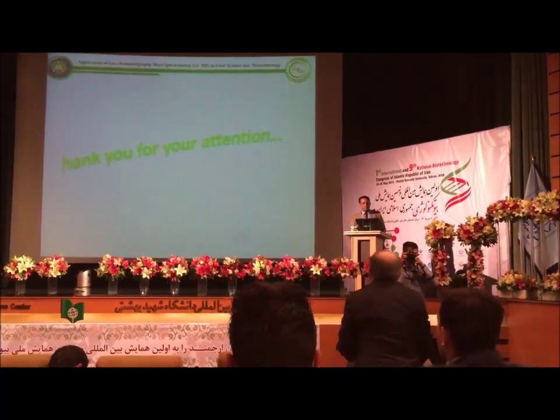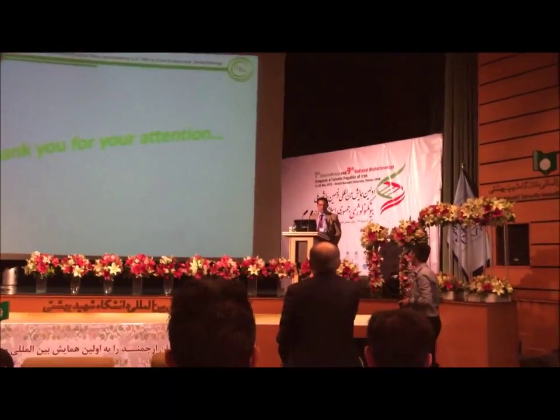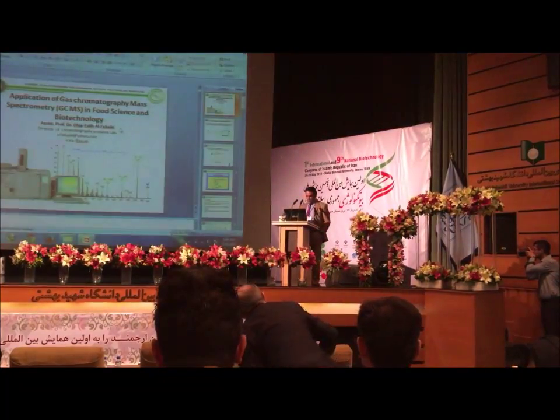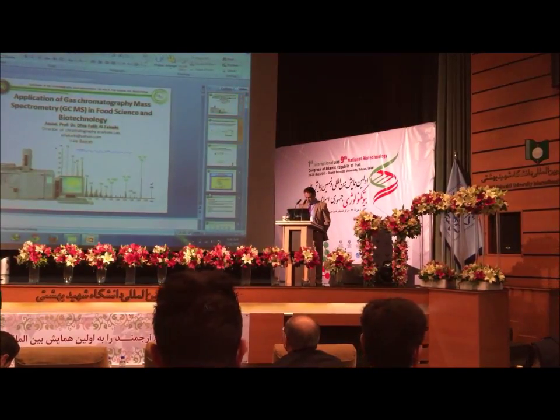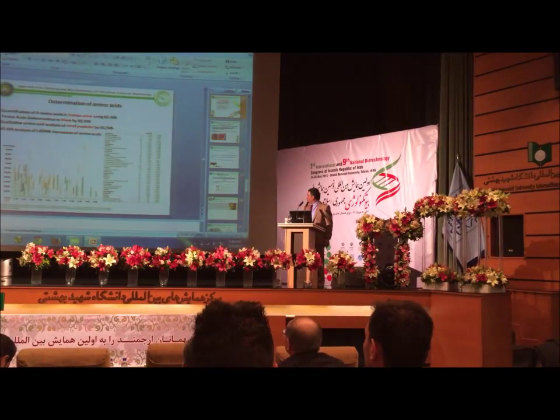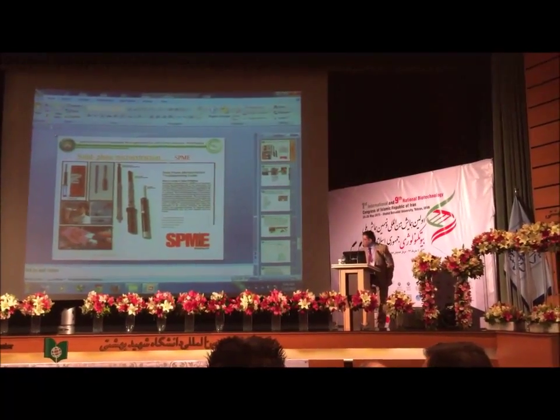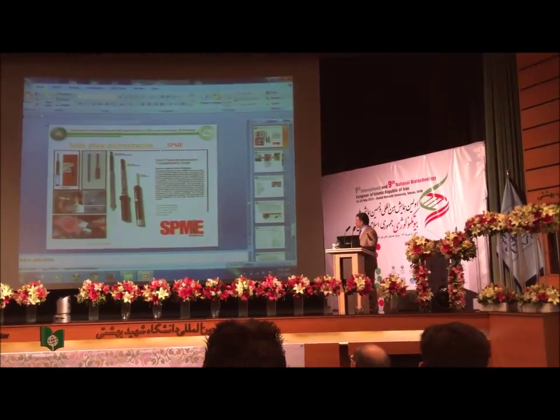Clinical use? Yes, any clinical use, because this tool, SPME, is very easy. This technique is a new technique in the world.